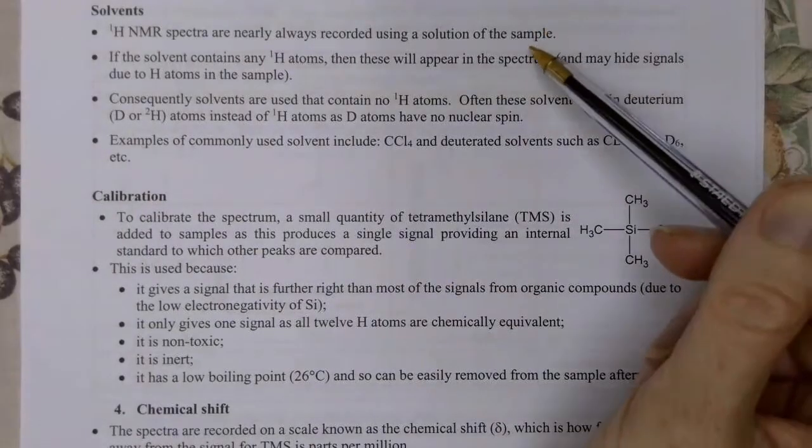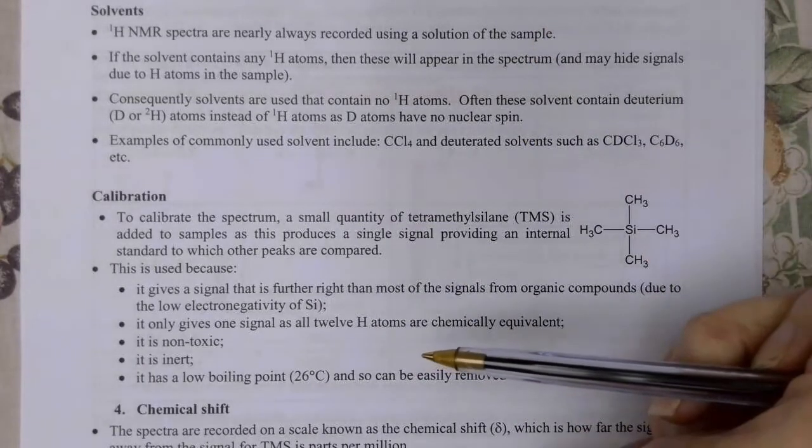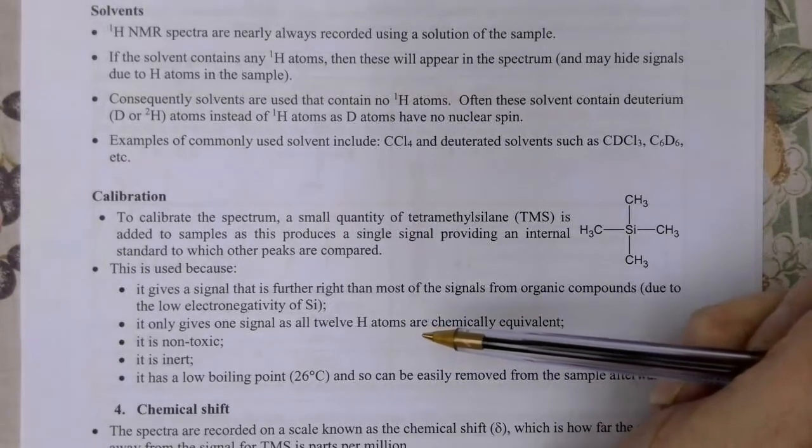Quite often we use solvents to dissolve our sample in a hydrogen NMR. We need to be quite careful of using our solvents, because obviously if they contained any hydrogen atoms, they could also appear in the spectrum and might hide the signals that we're actually interested in.